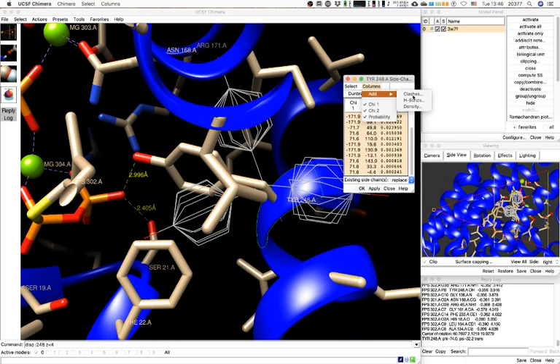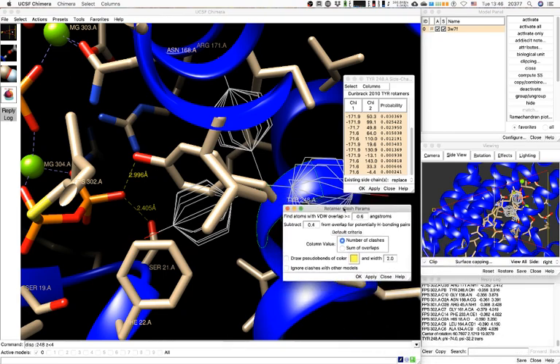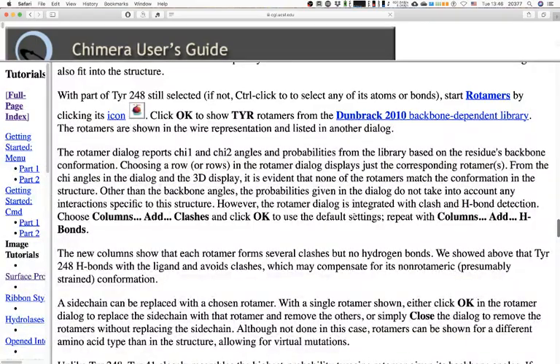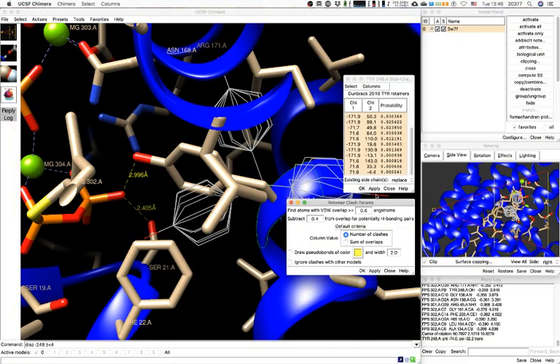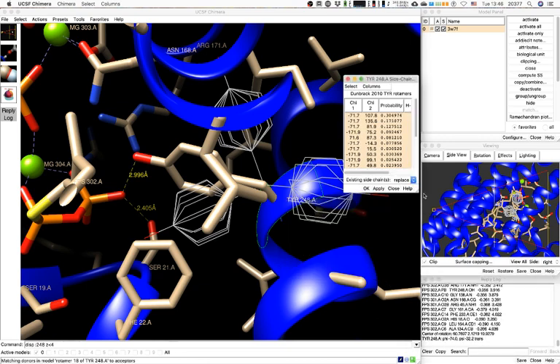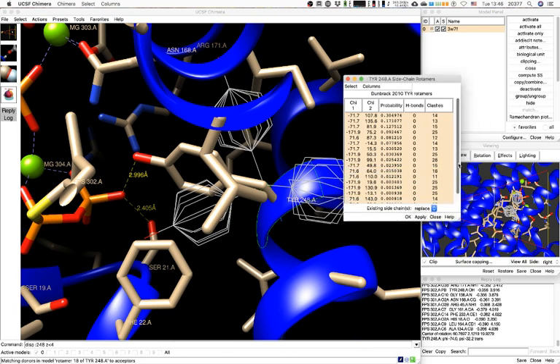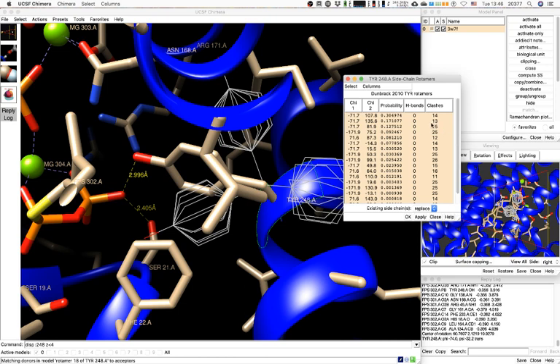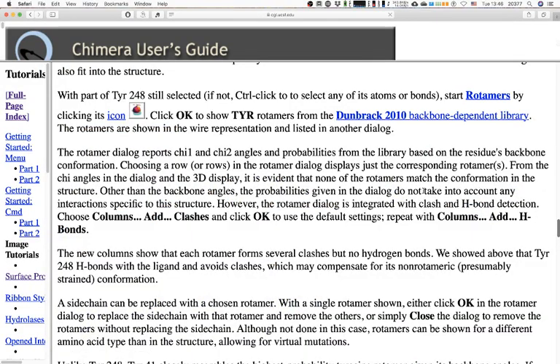Choose Columns > Add Clashes and click OK, then do the same for H bonds. You can see that all of the rotamers have tons of clashes and none of them has a hydrogen bond like the original structure does.